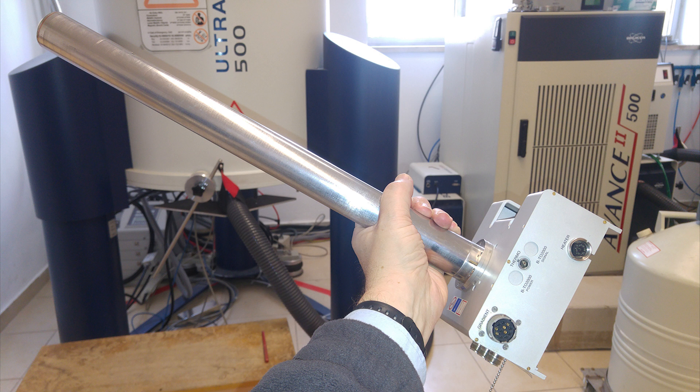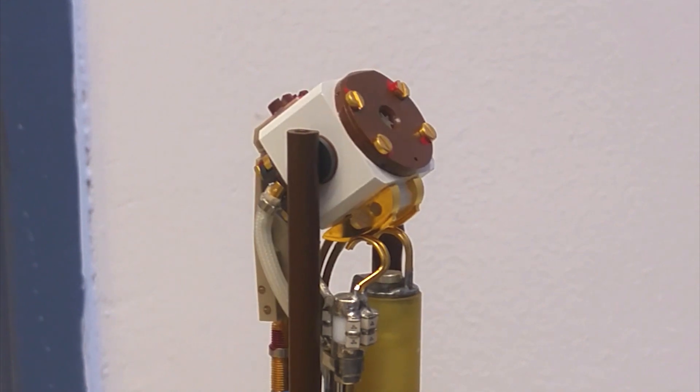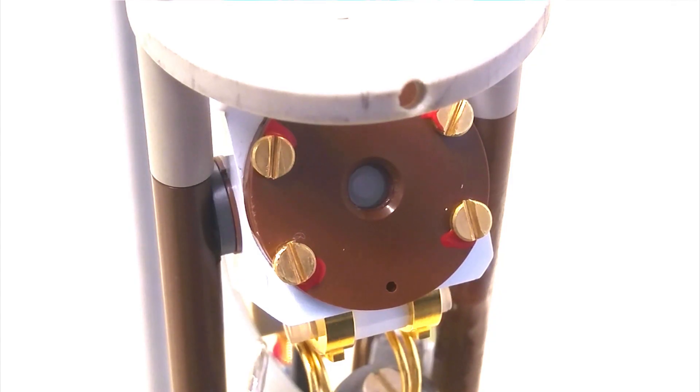An NMR sample is measured by a probe in the magnet. The probe transmits to and receives radio frequencies from the sample. In the case of solid-state NMR, the probe also tilts and rotates the sample.